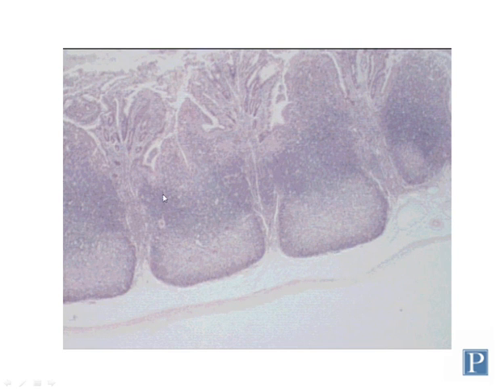Here's a higher magnification view of individual lymphoid nodules within Peyer's patch. In this case, you can tell that these nodules have a paler center that is lighter staining. This is an area of active proliferation of B lymphocytes that typically occurs when the tissue has been challenged with an antigen, perhaps through infection.